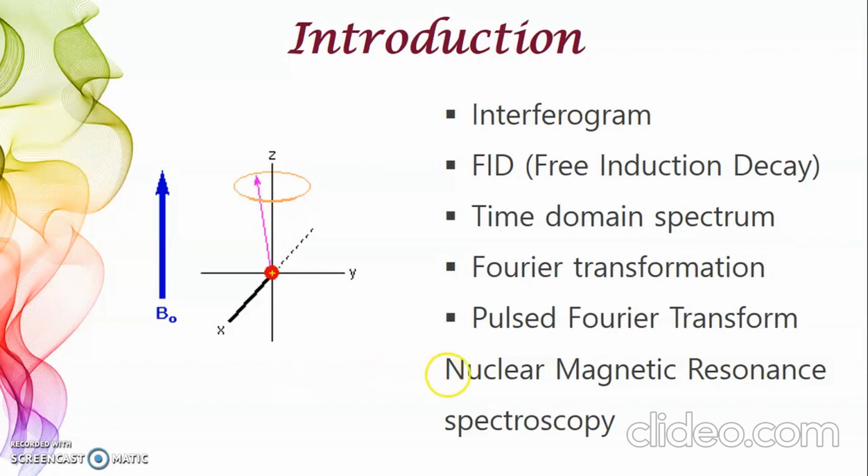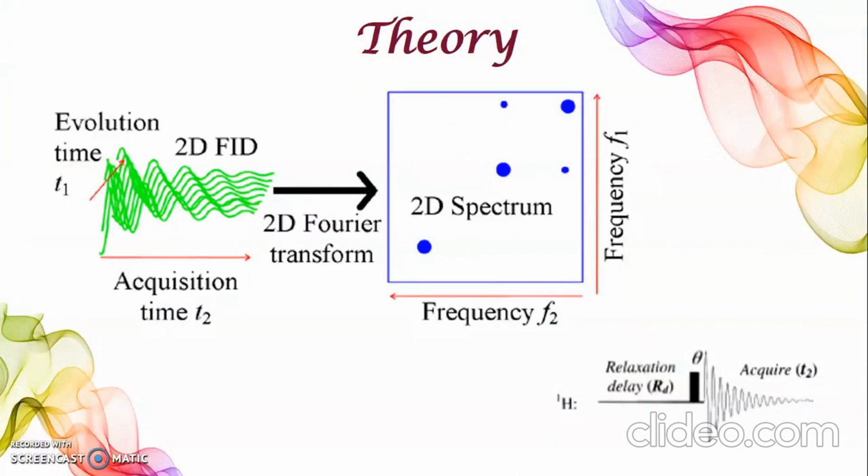We see the theory. In a pulsed spectrometer, the sample is placed in the magnetic field and irradiated with a pulse of high power radio frequency energy, with the frequency range sufficiently large to cover the entire range. This pulse simultaneously excites all of the nuclei in the sample. The excited nuclei begin to return to the ground state and radiate the absorbed energy. The detector collects this energy, producing free induction decay, which is the sum of all nuclei radiating over time.